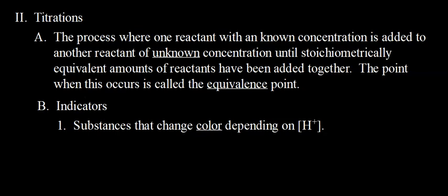All right, next up we have titrations. A titration is a laboratory technique, probably one of the most commonly used laboratory techniques in a chemistry lab. You'll be doing lots and lots of titrations in this class. You'll be doing lots and lots of titrations as well in college. So it gives very good results.